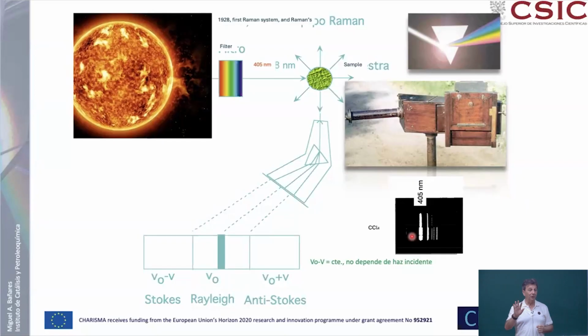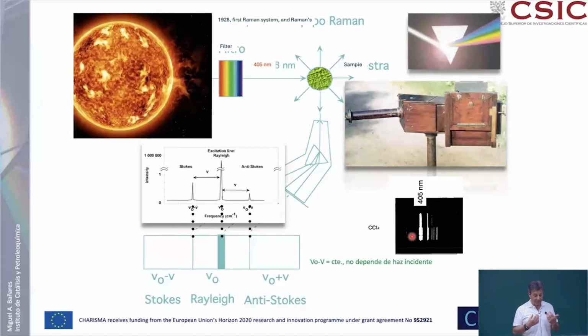And that's why we typically only look at one side, which is where the photons lose energy, because the Raman effect is per se very weak. So if it is very weak, you don't want to go to the less likely effect, but to the most likely effect. So when you make a plot nowadays, it will look like this.